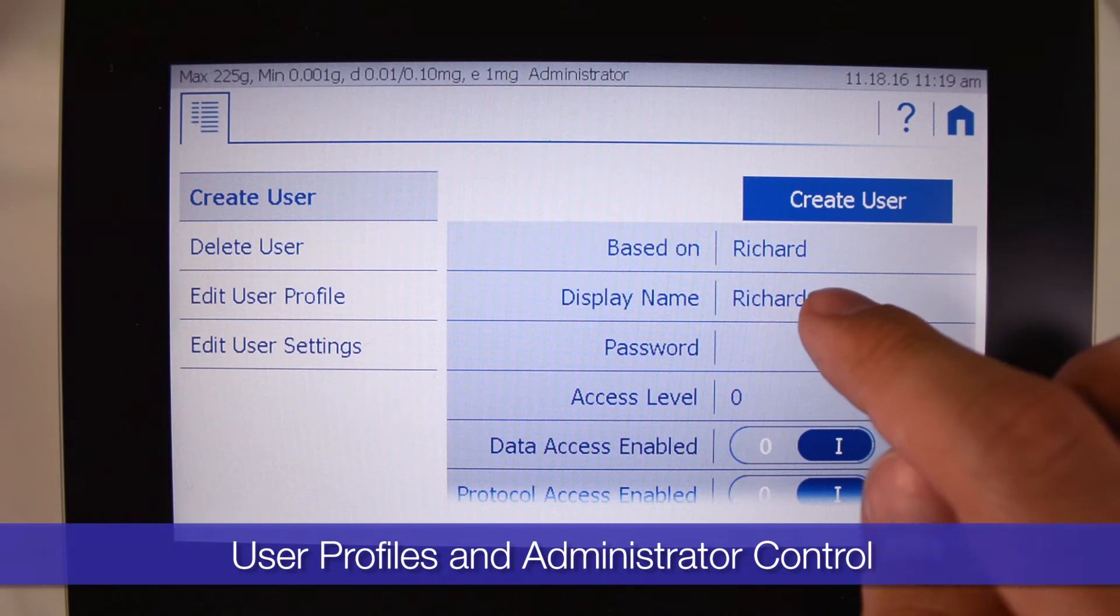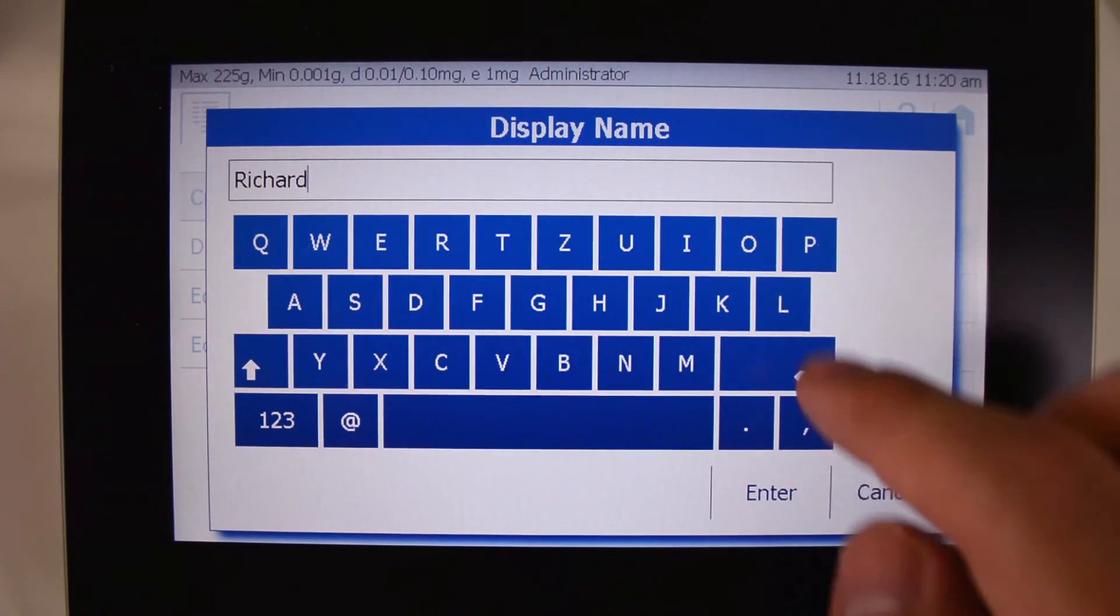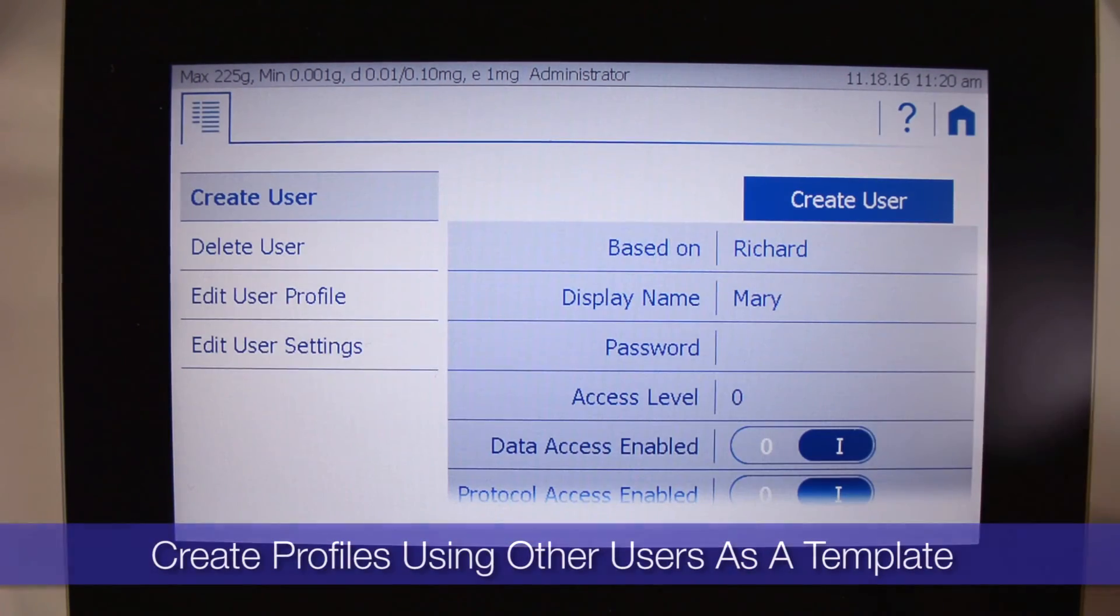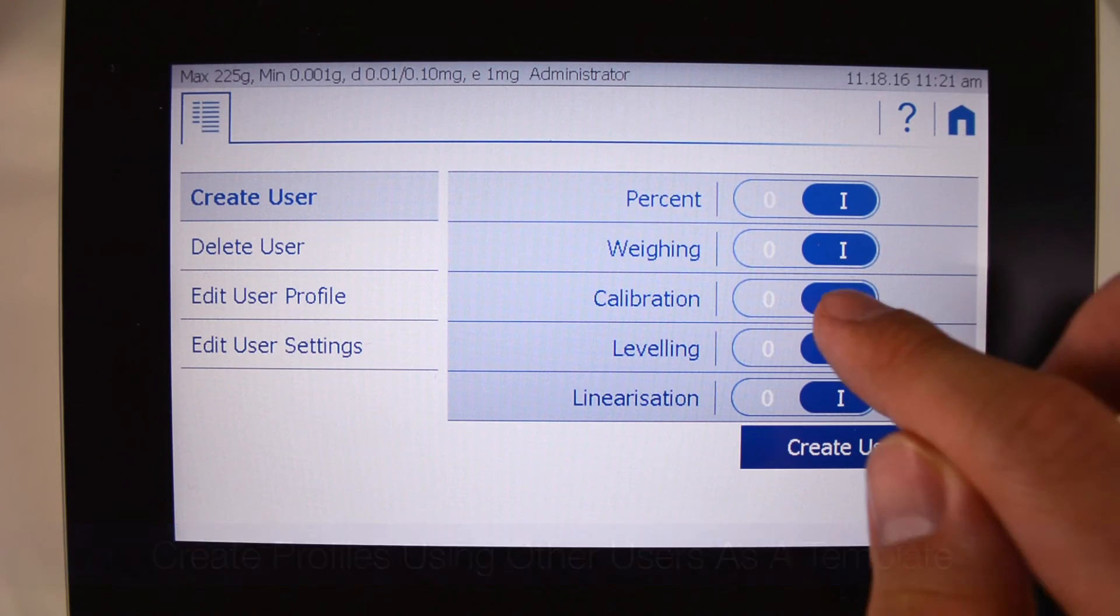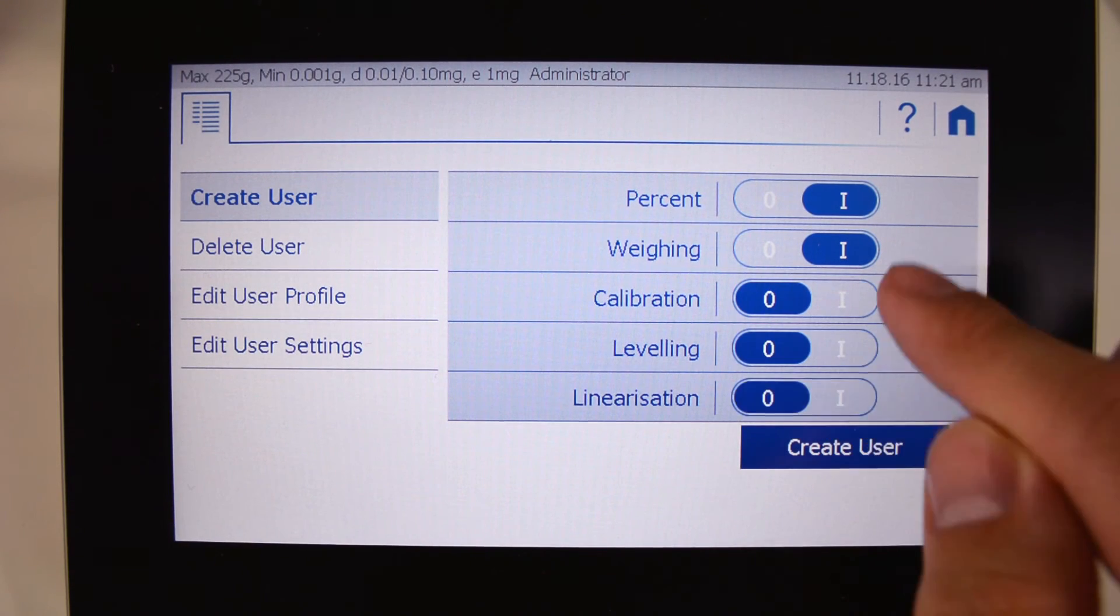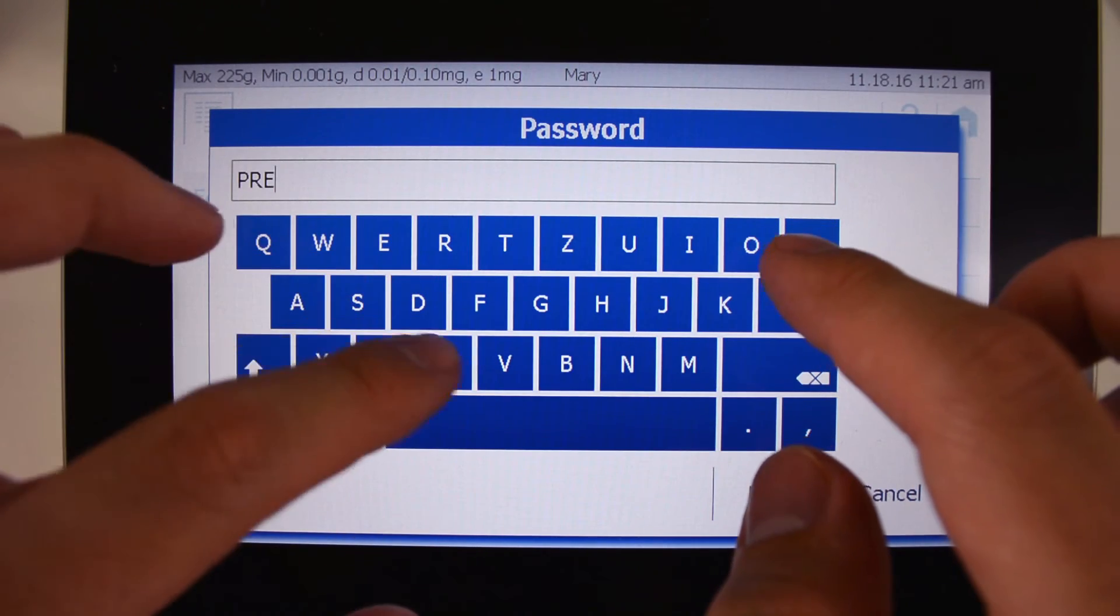The admin can set up additional users with their own individual settings and customizations. These profiles can also be selected as a template to create more users with the same settings and customizations to work from. You may also password protect each profile to prevent tampering with the settings.